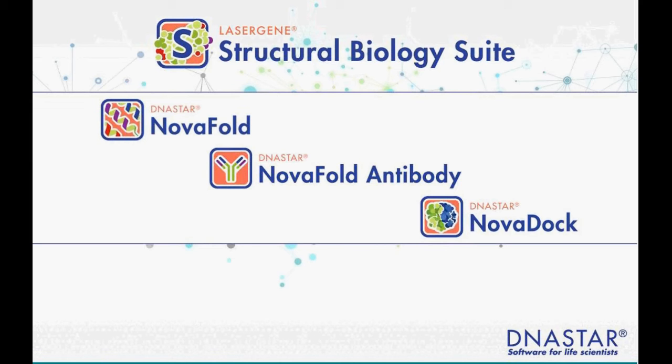More recently, we introduced NovaFold Antibody, which is a specific homology modeling workflow targeting the modeling and generation of structural models of immunoglobulins. We also have NovaDock, which through collaboration is an application utilized for protein-protein interactions and modeling the docking of those proteins.